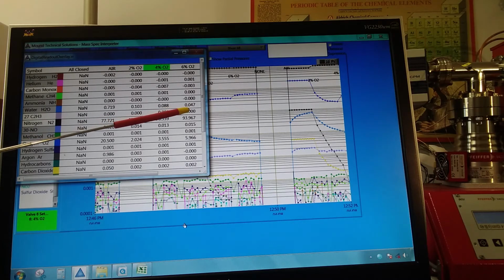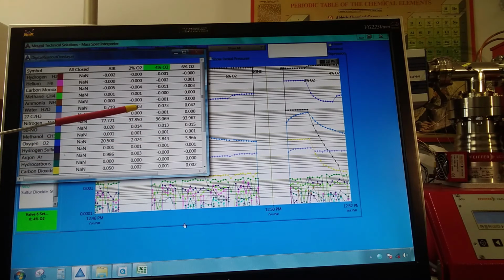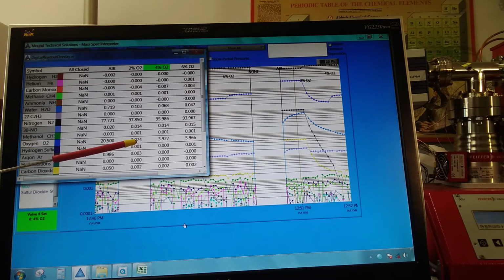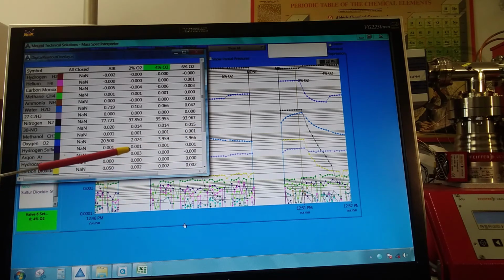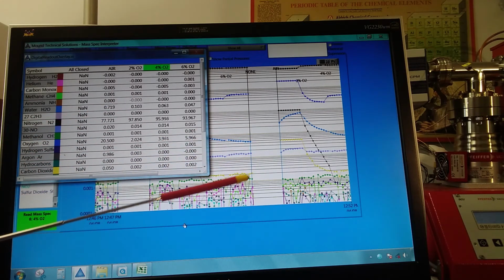The second two cylinders show that they dry out much better. I suspect if we sampled this capillary a little longer, it would even show that that gas is indeed drier. But we get a very good answer within our allotted 30 seconds, and we also pick up some data that we weren't necessarily looking for.